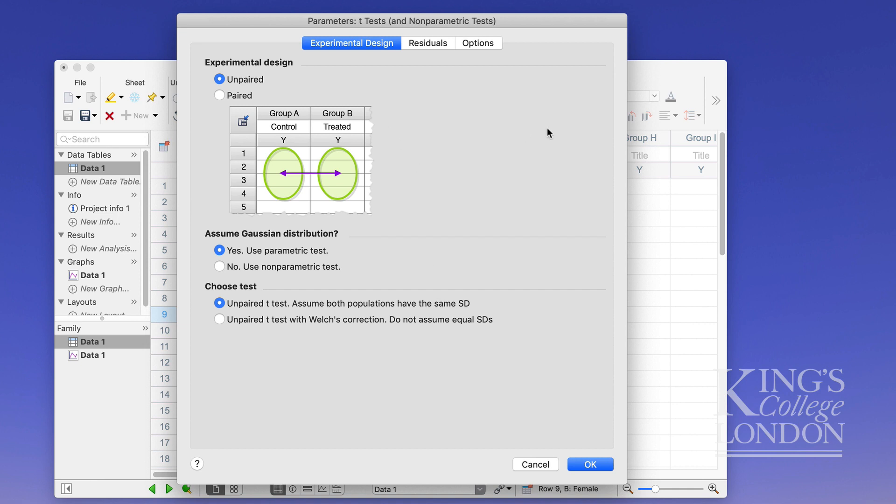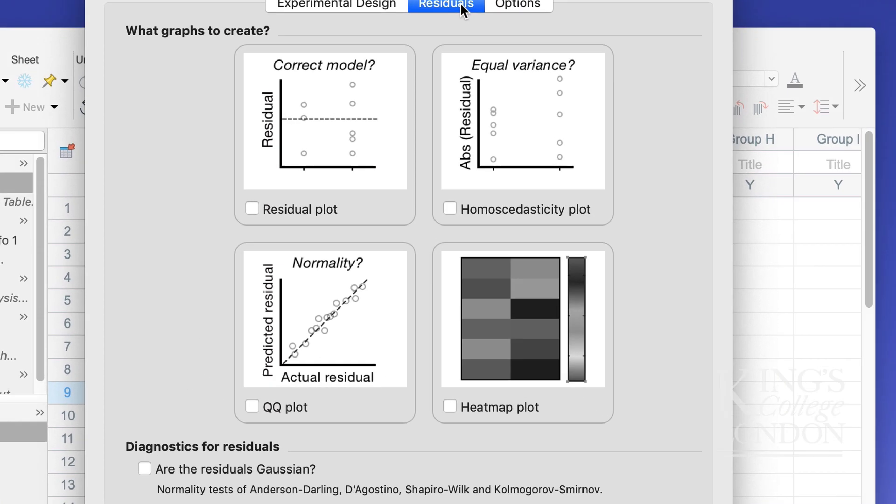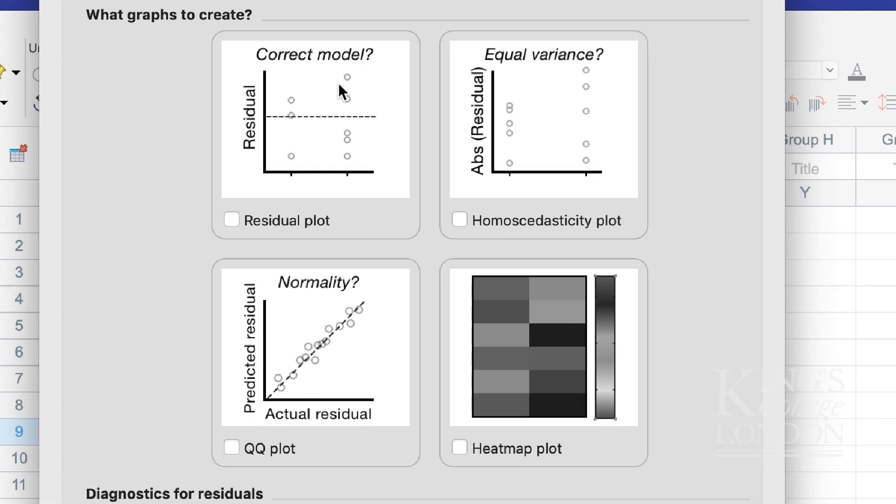There are no other options I need to click or change but for instance in the residuals you can look at residual creation these are quite a useful thing to have a look at residual plots, qq plots, or heat map plot for instance.